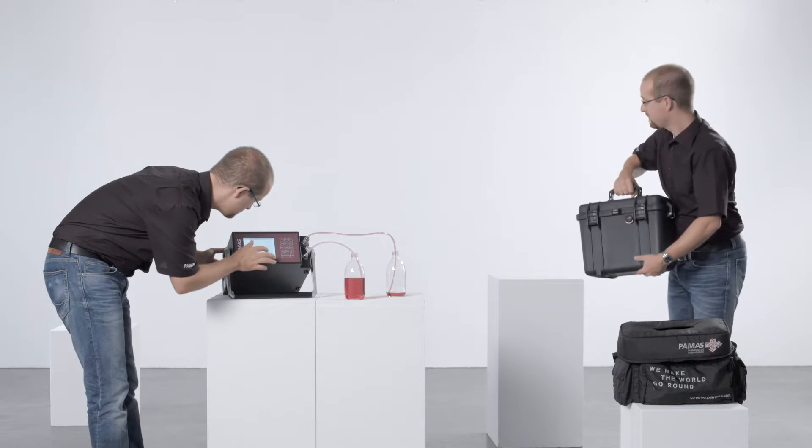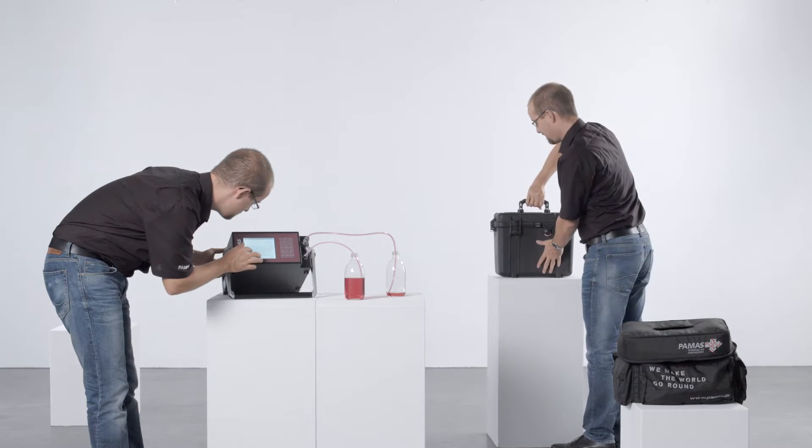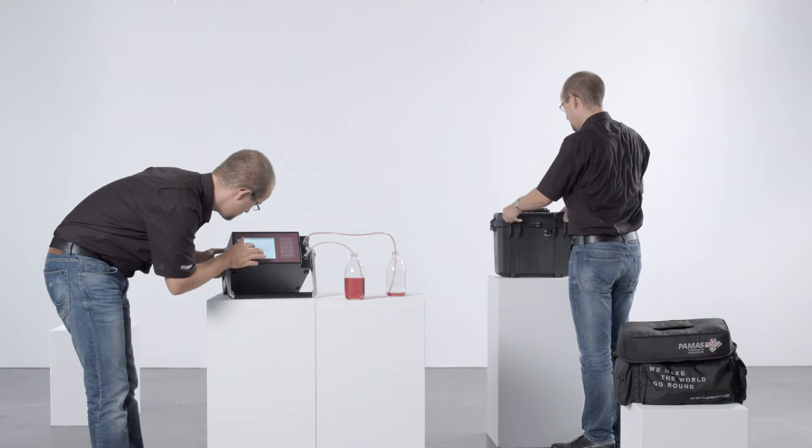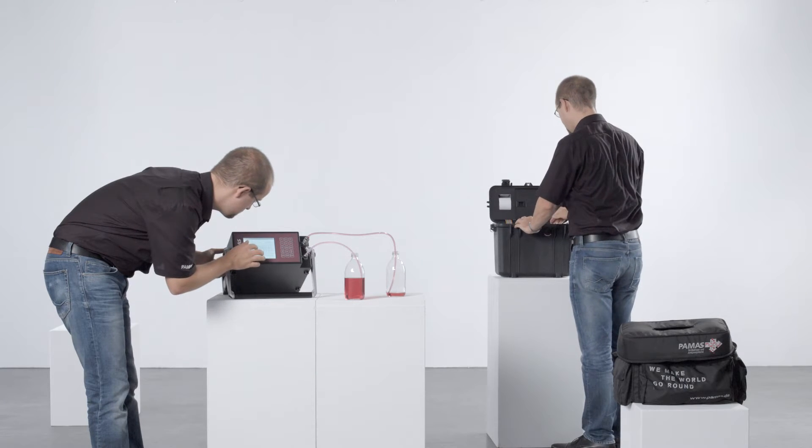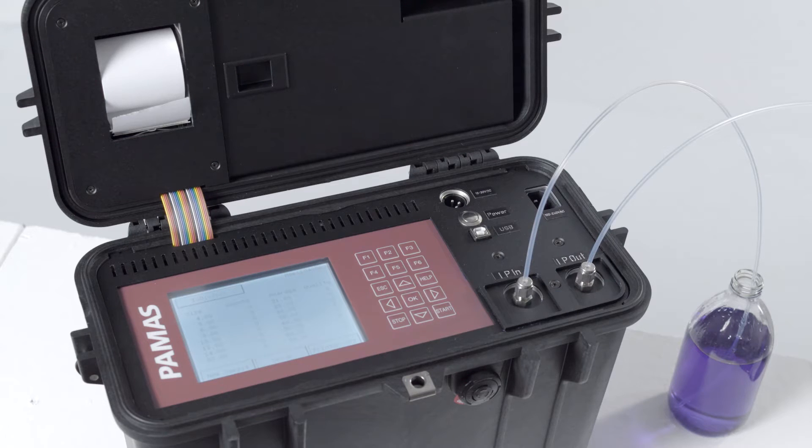The PAMAS S40 is available in a variety of product versions for different applications including oil, fuel, water, water-based hydraulic fluids and other chemical fluids.